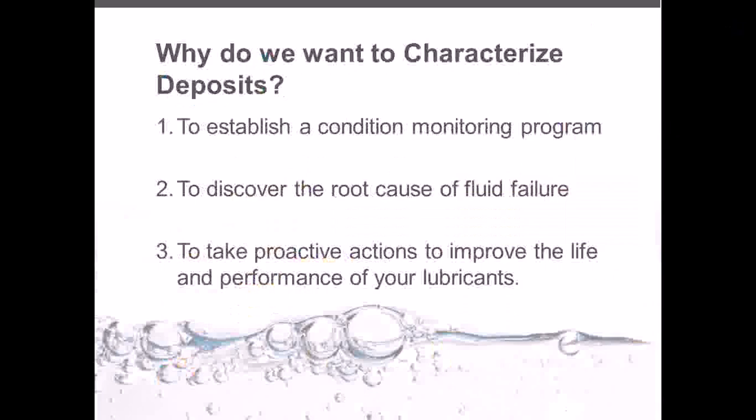And ultimately, from this information, from actually analyzing these deposits, you want to take proactive action to try to improve the life and performance of your lubricants. So how do we go about analyzing these deposits? The first thing, the easiest way, is appearance.